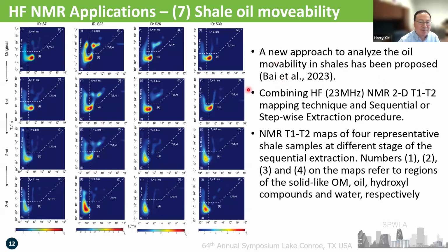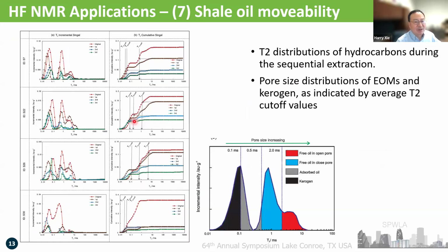So this has been published in the OTC conference. With that, you plot the change in the T2s. You can see clearly there's a change, the trend going down. So this is the amplitude going down. Then you can produce this 2 peaks system, or maybe 3 peaks.